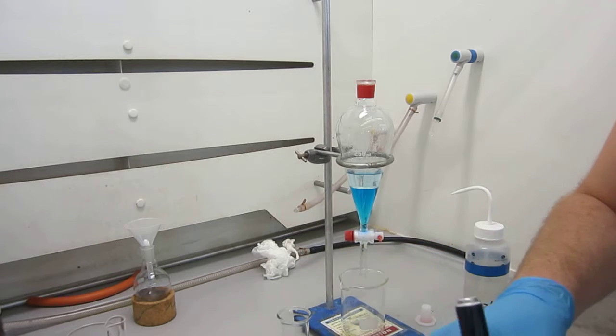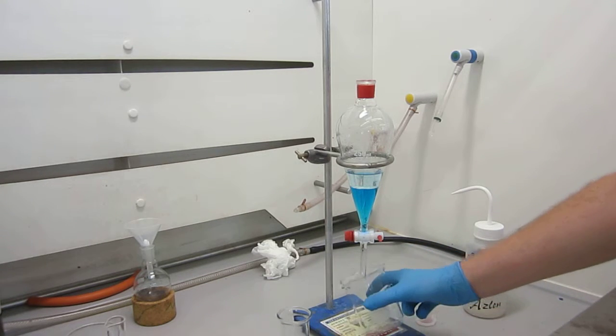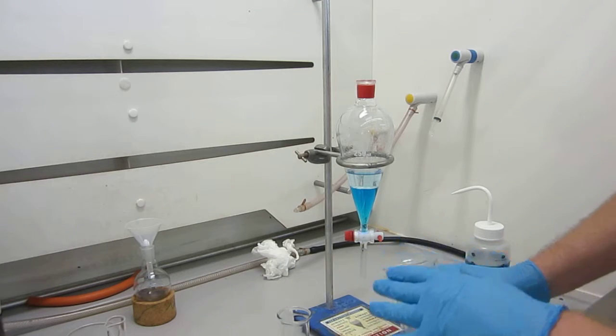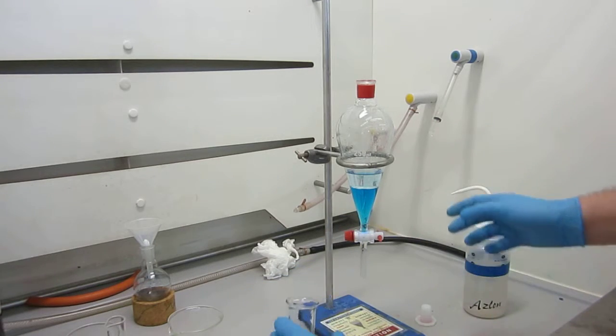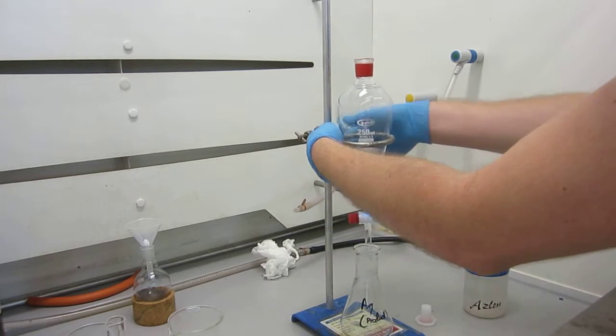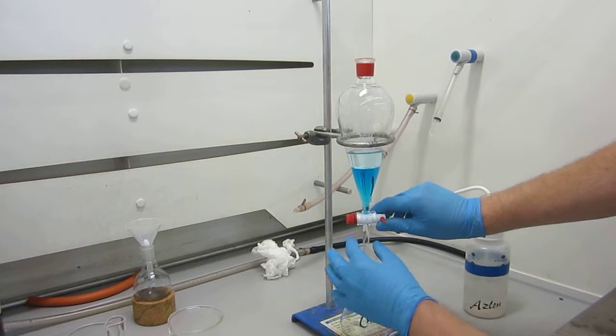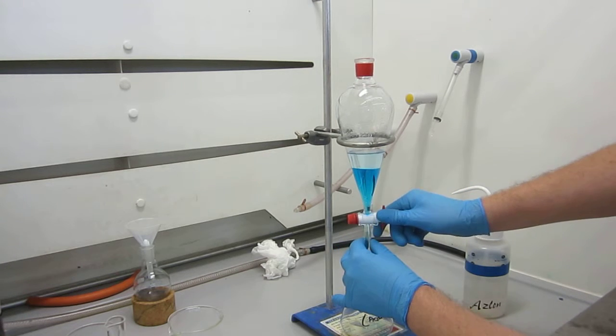Make sure you label your conical flasks or your beakers or whatever you use to collect your layers in, because it can get very complicated very quickly, especially when they're not a coloured solution. So I'm going to take my conical flask. I'm going to make sure the bung is out. I'm going to run through the aqueous layer into my conical flask.